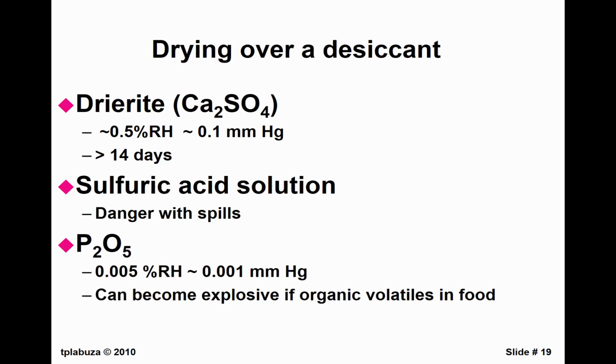They had gone into the teaching lab where you guys have the class, and one person looked into the hood and saw desiccators there that had samples in them, basically things like propylene glycol, glycerol, things like that. We were drying them down because we were going to use them for controlling water activity, so I wanted to make sure there was no water in them. And we had phosphorus pentoxide in the bottom.